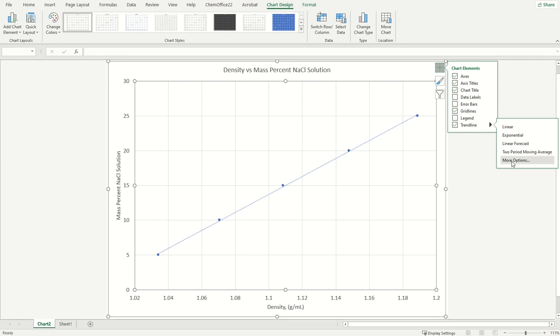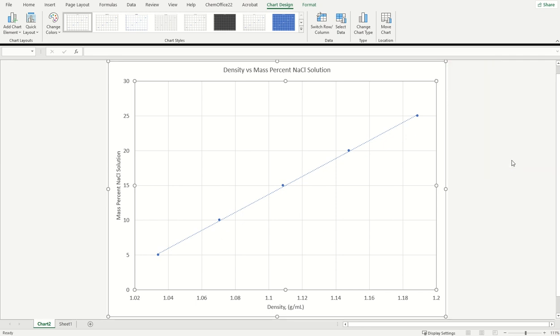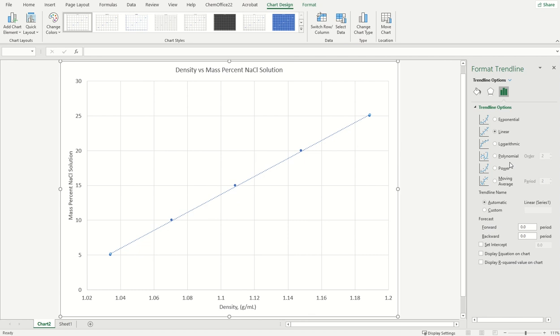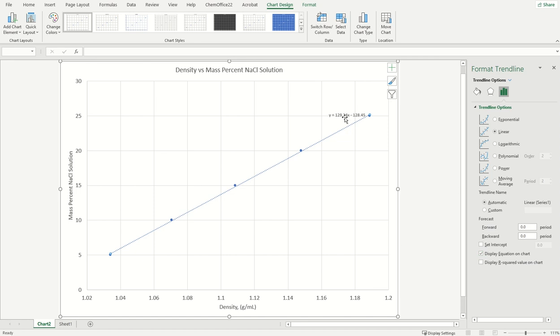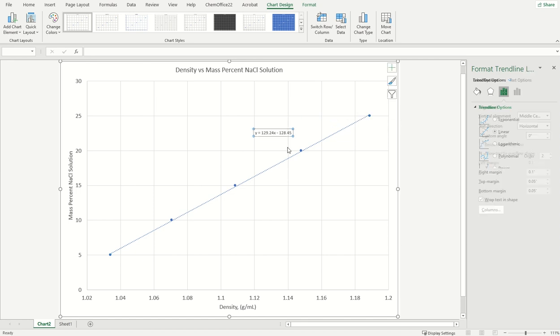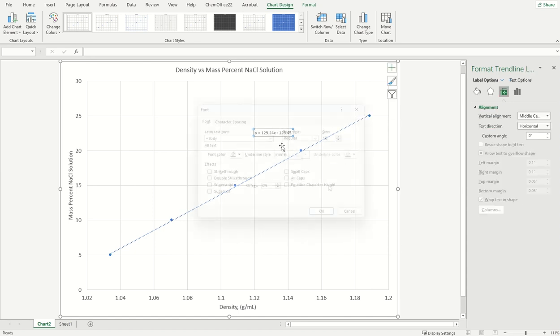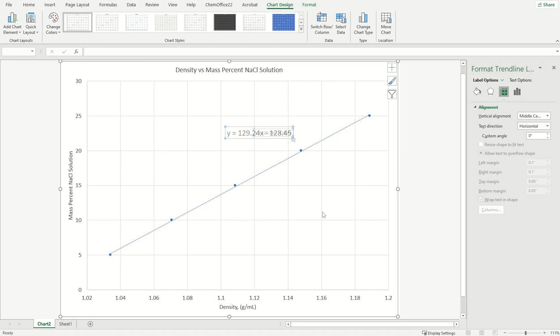Click this button that says to go to more options. And so we'll see those trend lines. Again, linear is selected. But this is what we really want: this display equation on the chart. And so that's important because it's going to display the equation for this line. And this is our calibration line or calibration curve. And when I click that, I'll get this equation right here.